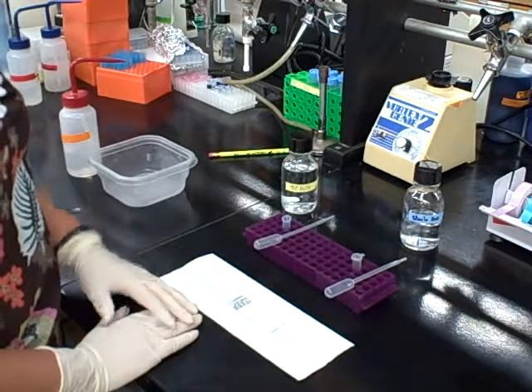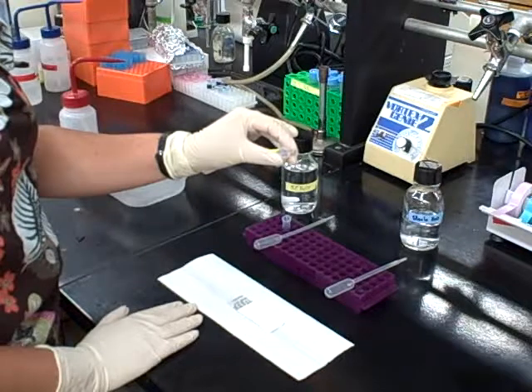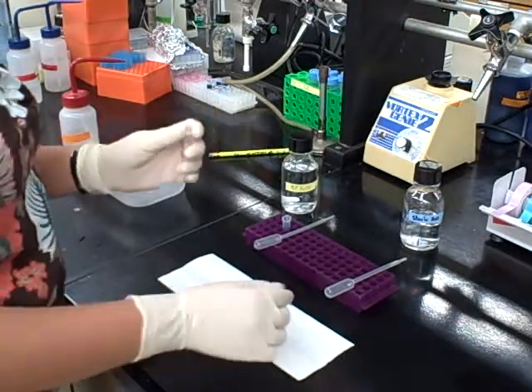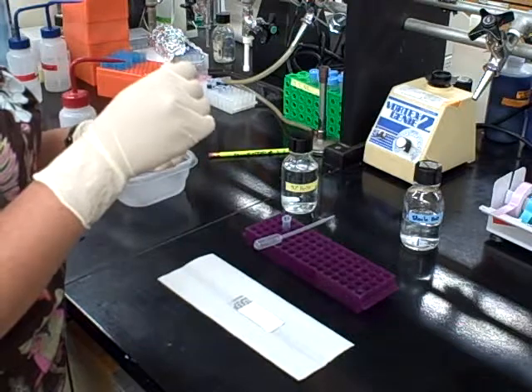The first thing is to add the mix of the cDNA solution — the two different cDNAs from the two different conditions, breast cancer and non-breast cancer tissue. The solution is placed on top of the slide, which will then adhere to the DNA that's on the slide.